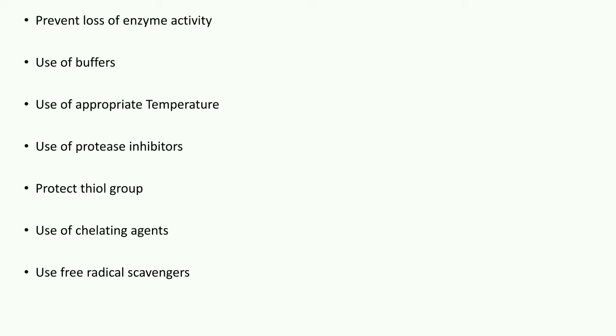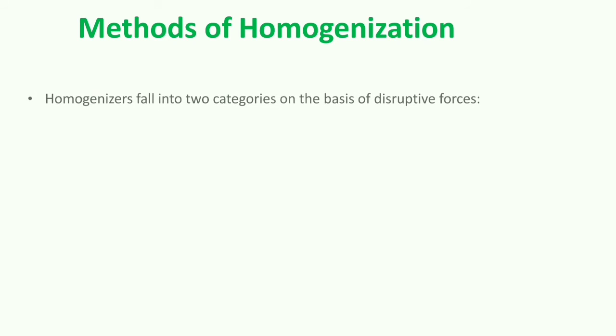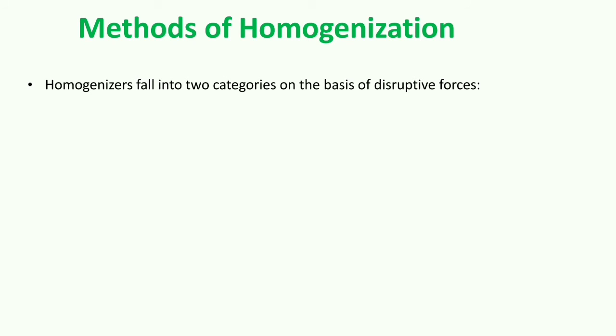There are many recent developments in enzymology. Methods are continuously developed for extraction of enzymes. Methods of homogenization. Homogenizers fall into two categories on the basis of number of times the disruptive force is applied to bring about cell disruption.